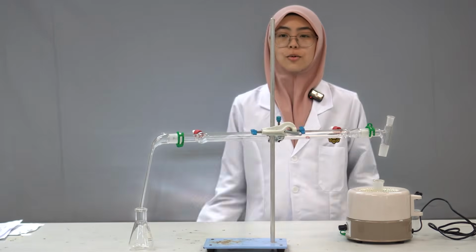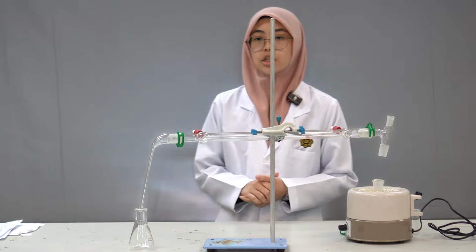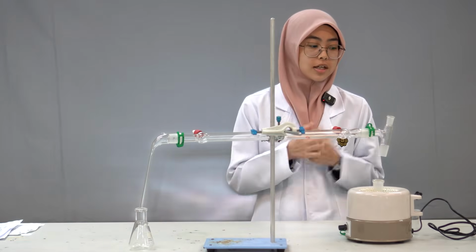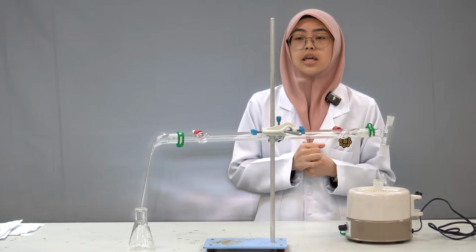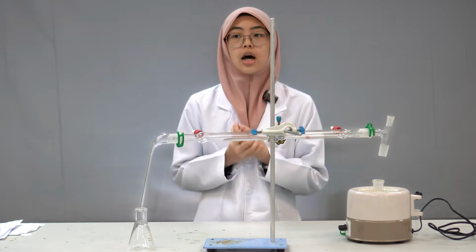Assalamualaikum warahmatullahi wabarakatuh. Today I'm going to present about the health, safety, and precautions during the experiment. The first part is about health and safety. In this experiment, we will handle a lot of chemical substances that are really corrosive and can penetrate our skin, so we need to wear our lab coat and also gloves.